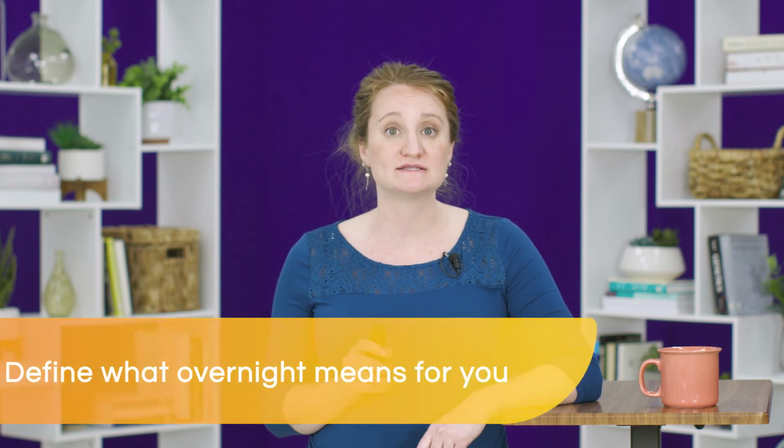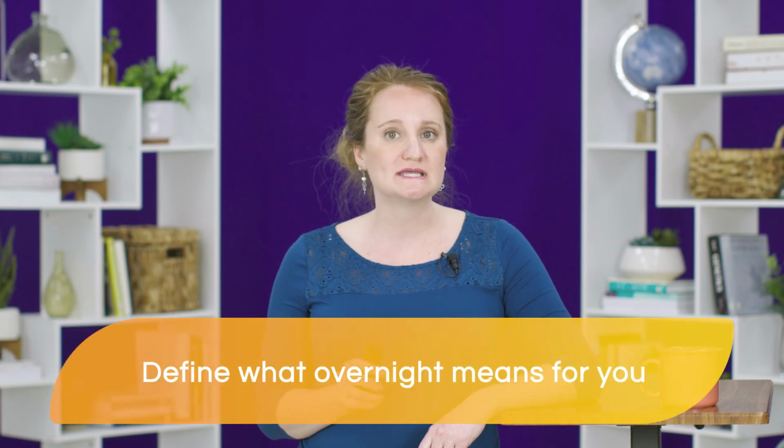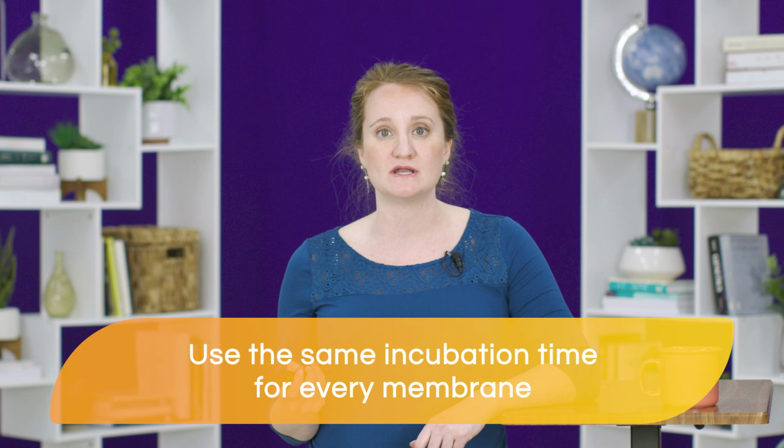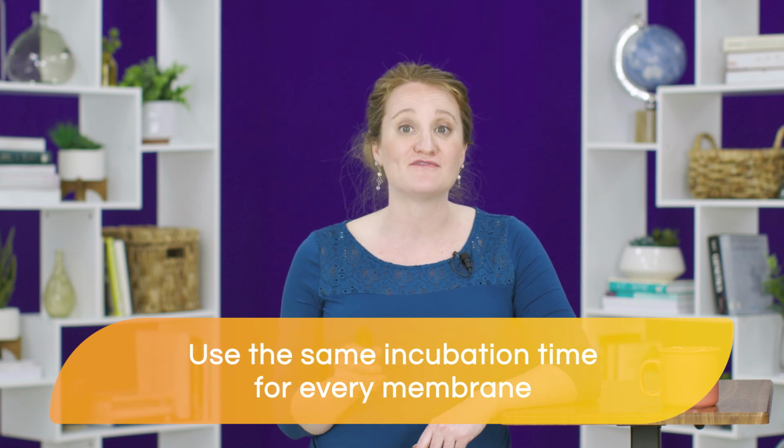So, about that time frame overnight, oftentimes ambiguity arises when a protocol calls for an overnight incubation. If you're incubating your membrane in the primary antibody solution overnight, you should really define what that time will be. To some, an overnight incubation can mean any time from 12 to 20 hours, but it most commonly means 16 hours. So once you choose the time for your overnight incubation, make sure to use that same time for every membrane.